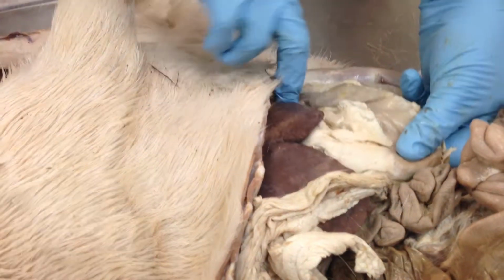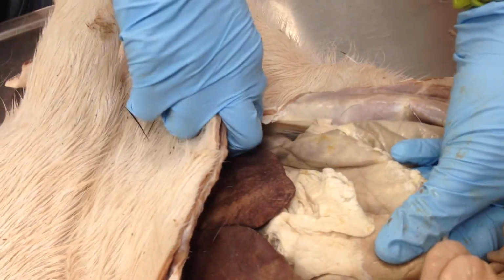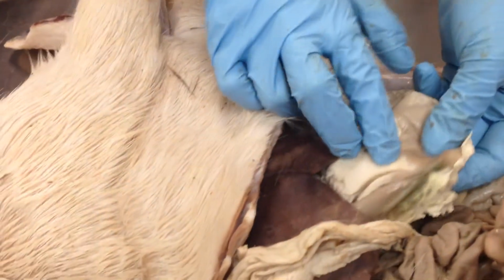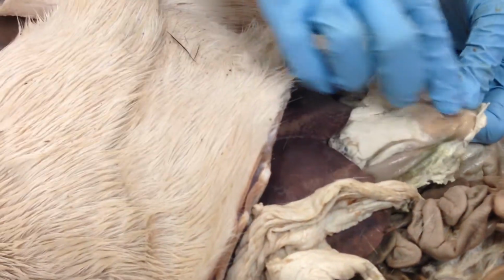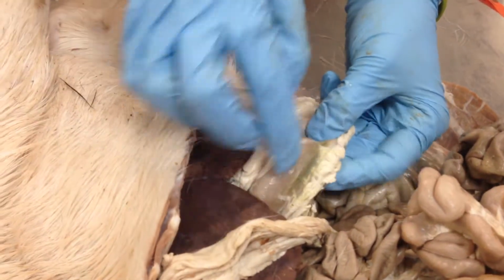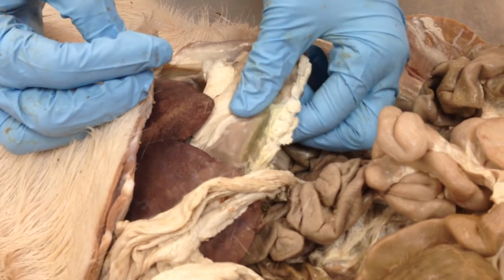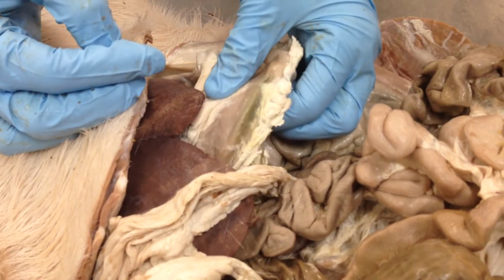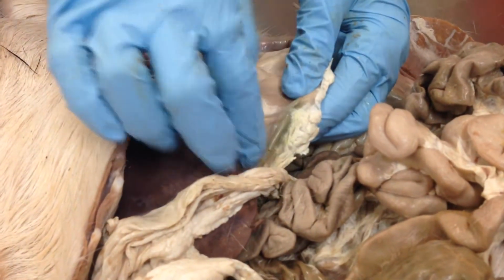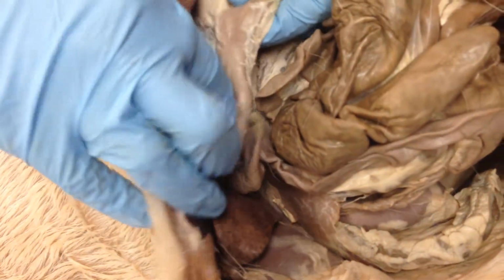The stomach has the fundus and the cardia towards the front end or the more cranial side. The caudal side has the pylorus. So this region of the stomach is called the pylorus. This part where it's going from the stomach into the small intestine up here is called the pyloric sphincter. So you can feel it, it's a sphincter muscle that's restricting movement of food from the stomach to the small intestine. So the first part of the small intestine is called the duodenum. This right here is the duodenum.